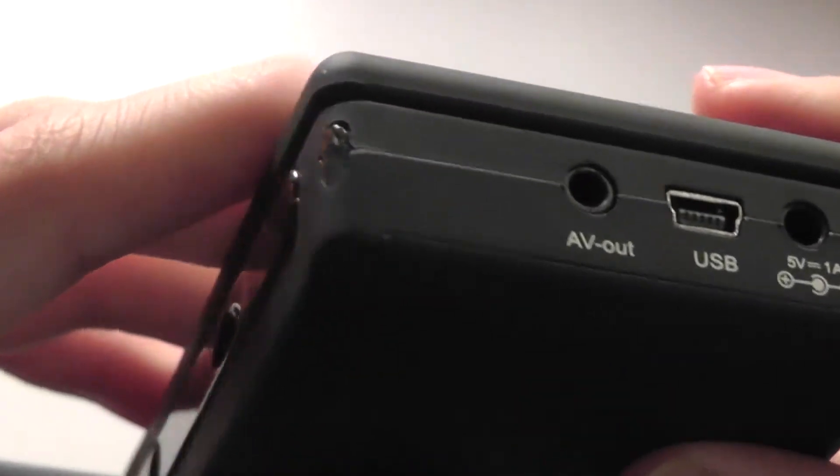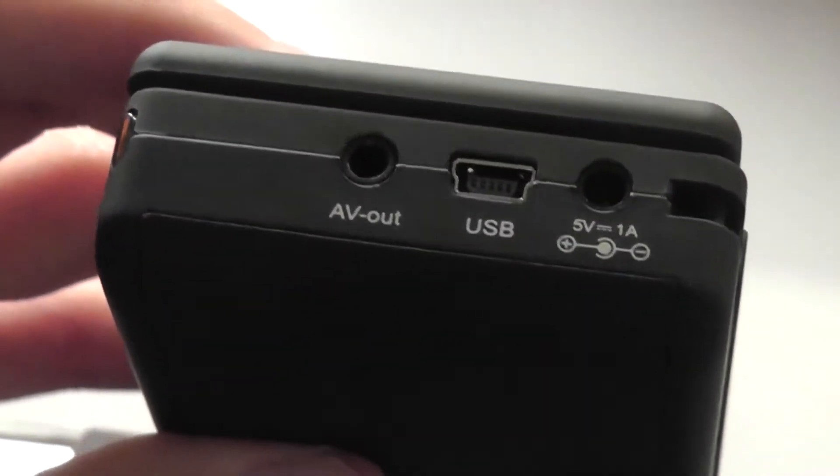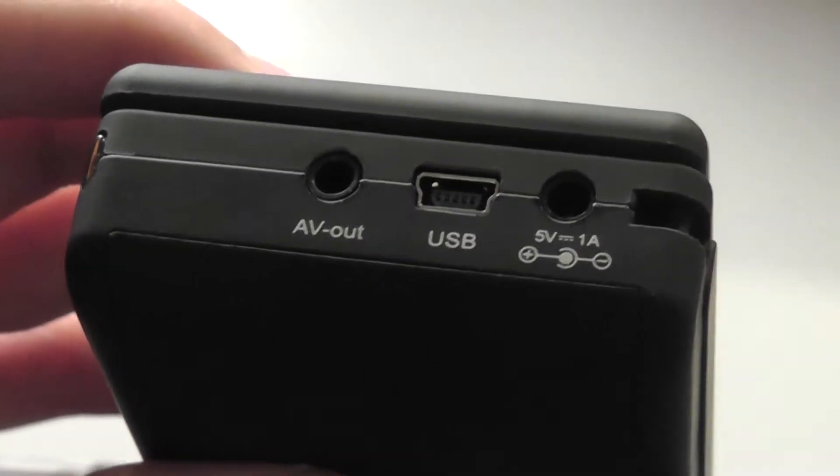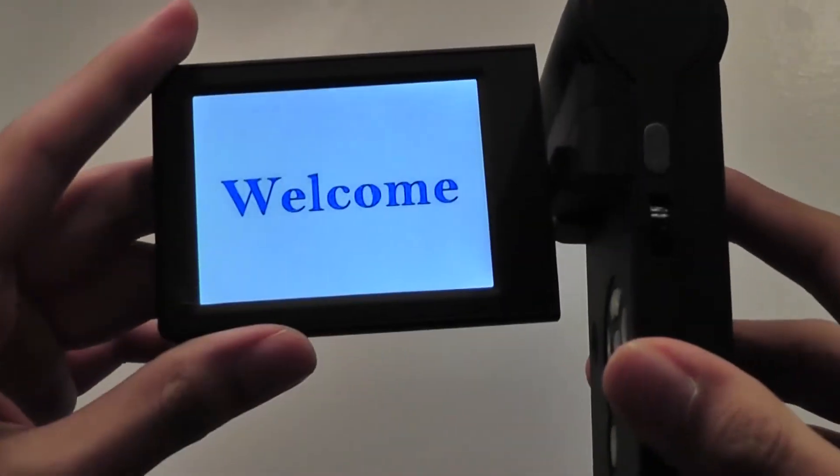There's an LED indicator on the side, and on the bottom there's an AV out cable, a mini USB for syncing, and also a charging port which is proprietary, and also the user interface of the actual microscope itself.